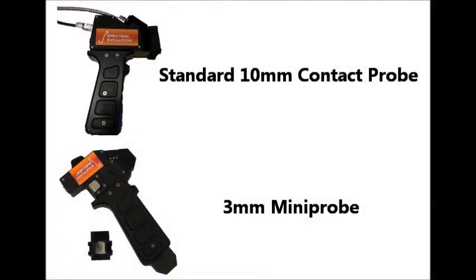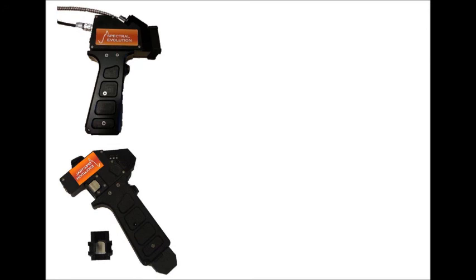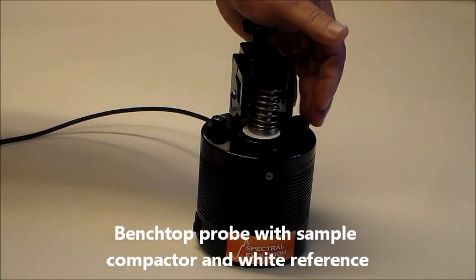Accessories include two contact probes — a 10-millimeter standard and a 3-millimeter mini probe — as well as a benchtop probe with sample compactor and reference plate.